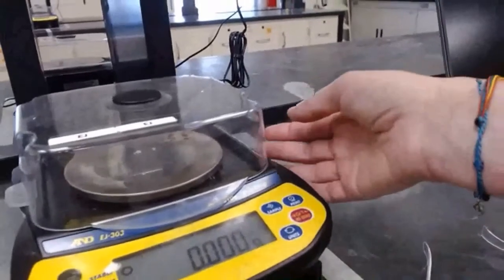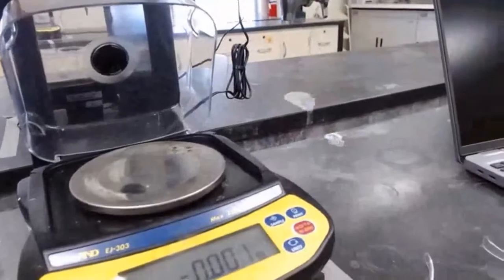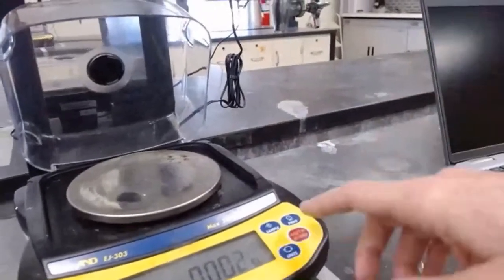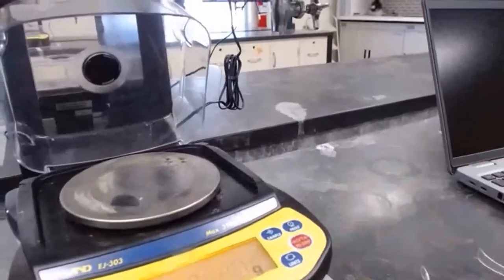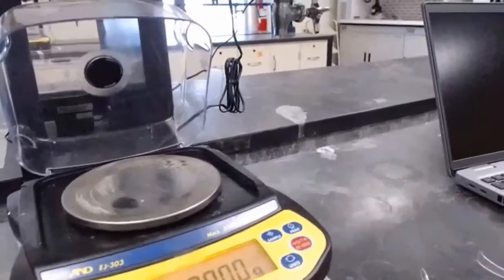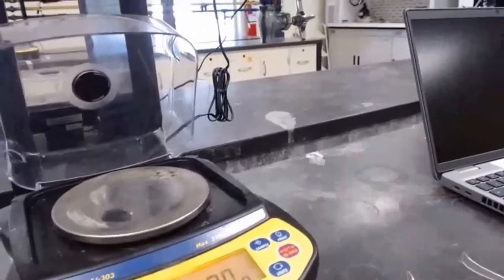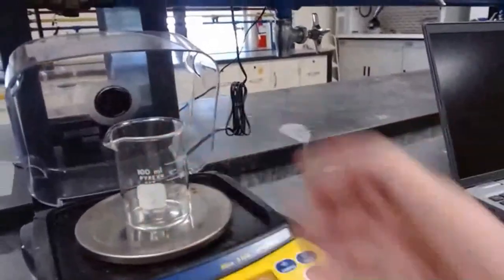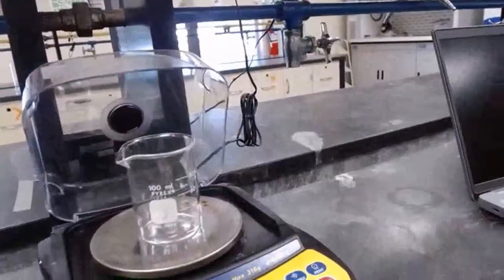So when you want to record a measurement of an object, the first thing that you'll do is hit the 0 button. Even if you see 0, you still want to hit the 0 button. Then you place the object directly in the center, and then you wait.